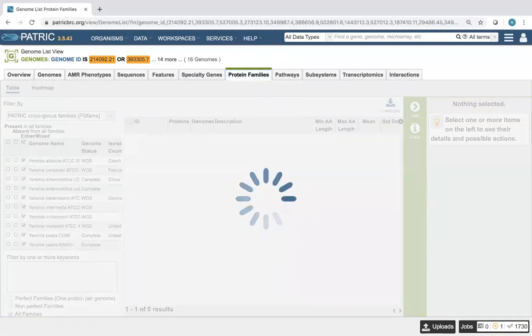And sometimes it takes a while to load. So we'll just wait patiently. I always try to arrange the circles so it's as mesmerizing as possible, because when you're waiting for something to load, it can be a little boring.